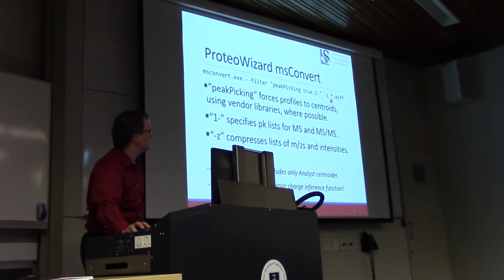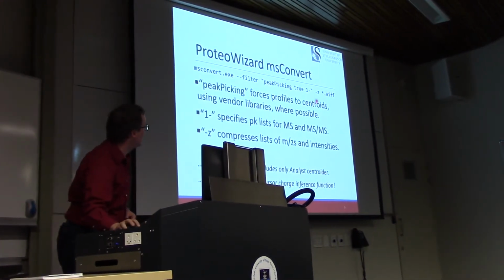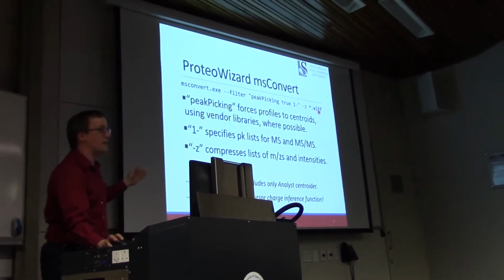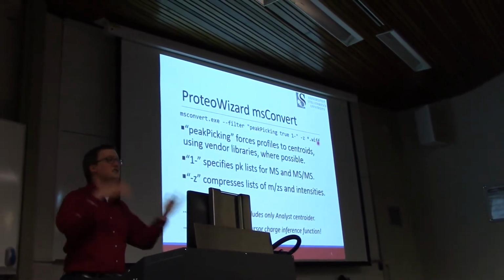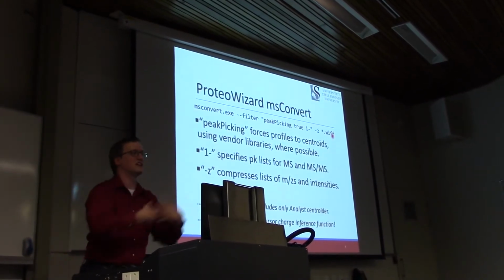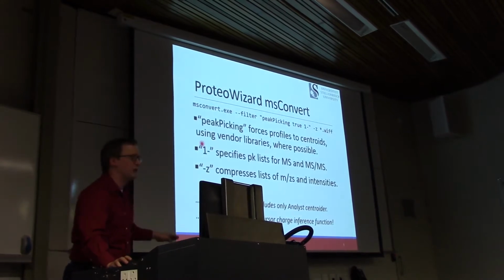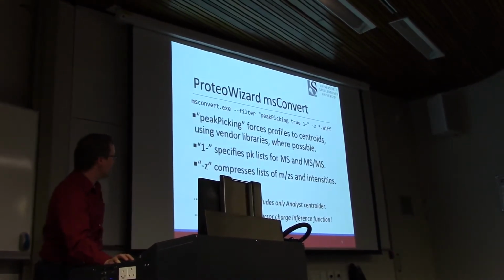We try to use zipping in order to cause the files to become a little bit smaller, and in this case we can apply that very same command line to WIF files just as we would to raw files. So WIF and scan files, these are the things that come out of a TripleTOF experiment. I've tried to unfold some of those down here. But I want to mention that there are a couple problems with that.